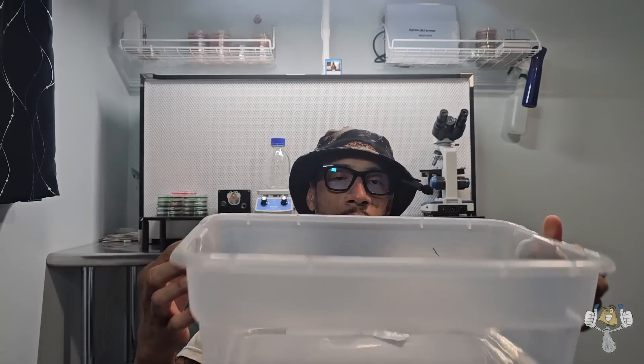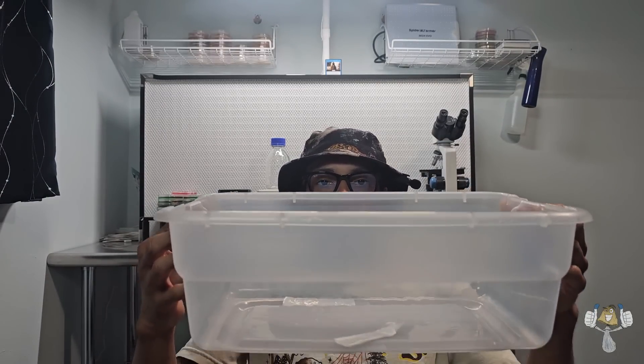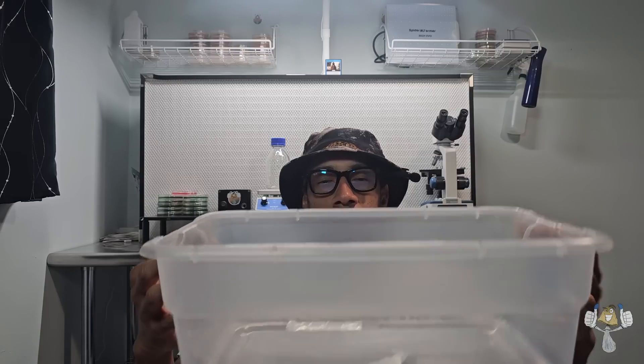Here is my mycology supply kit bin — this is where I keep all my stuff. We've got gloves, paper towels, scissors, scalpel blades, torches, micropore tape, and grafting tape which we use for agar dishes. Got an extra lighter too. It's just a 12-quart bin with all the supplies I know I'm going to use once I start working — just an idea for you.